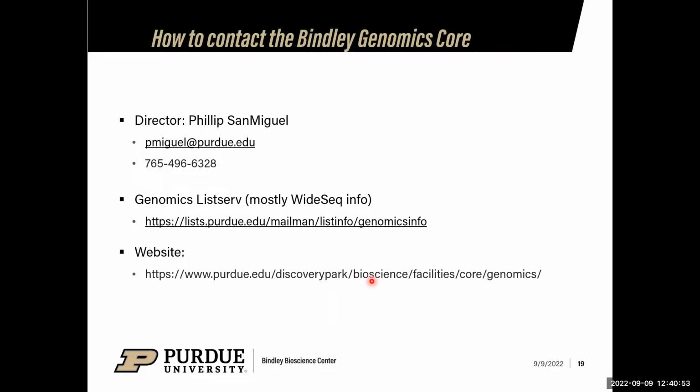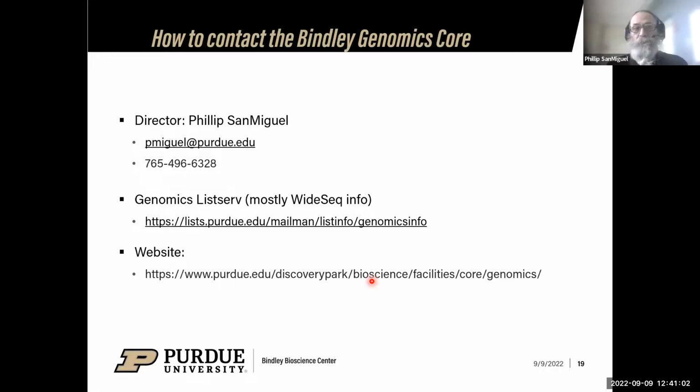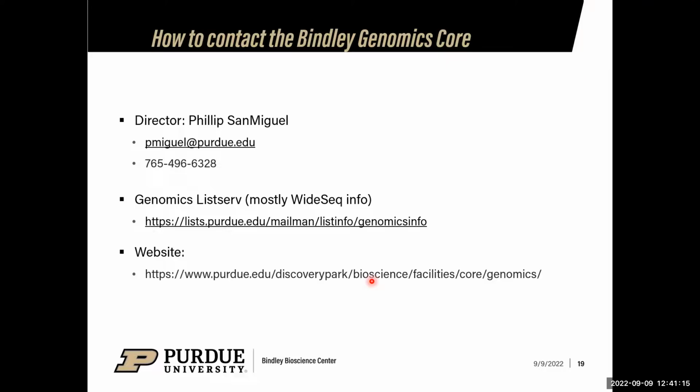So Phil, you mentioned about 10 microliters of DNA. What quality do you need? I would do an actual plasmid prep, and it'd be better if you did. So are we talking plasmid DNA? Is that the idea here? Or long PCR? Long PCR.